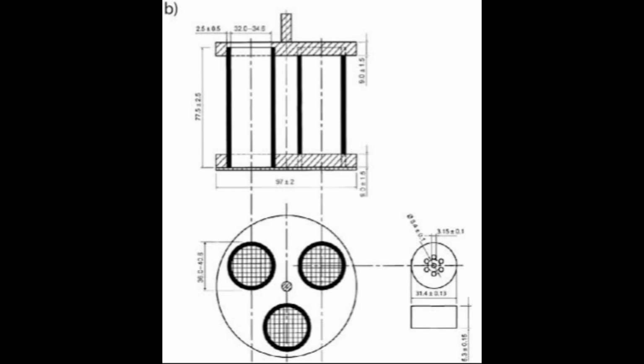subsequent drug release. Q. Contrast disintegration testing with dissolution testing in one sentence. Ans. Disintegration versus dissolution. Disintegration tests how fast a dosage form breaks into granules. Dissolution measures the rate and extent of the API going into solution.